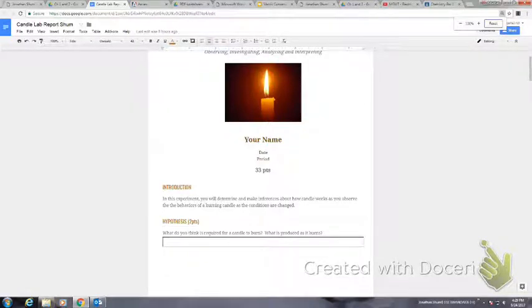All right, so this lab, our goal is to determine the products and the reactants of a combustion reaction. So just to frame this whole thing, basically everything you did was to prove either a reactant or a product of combustion. So let's just remind you what the reactants are. Reactants are what you put together in a reaction. So it's what's required in order for combustion to occur.